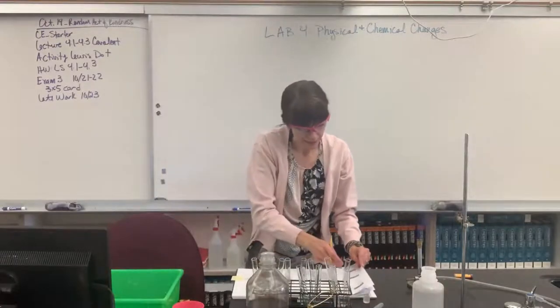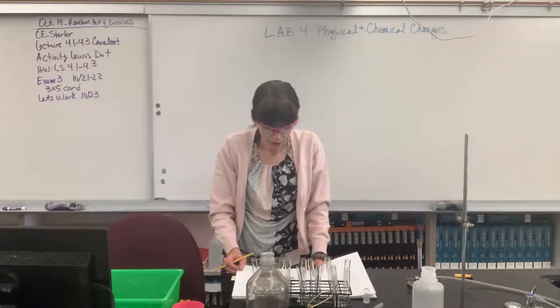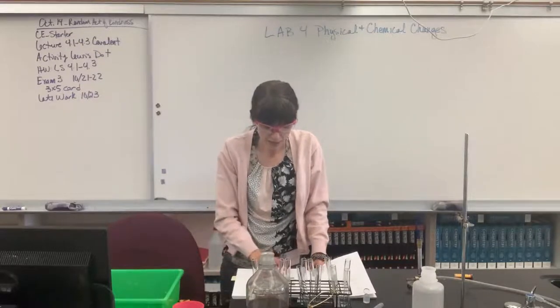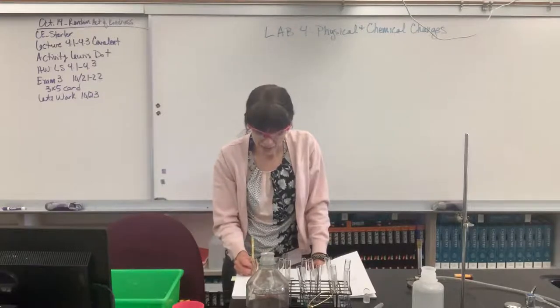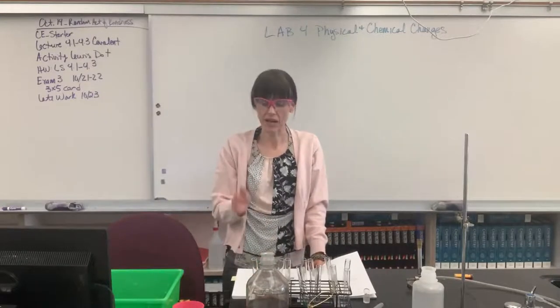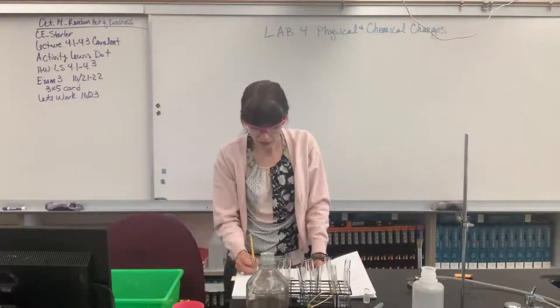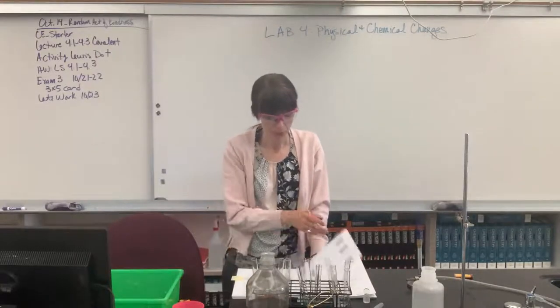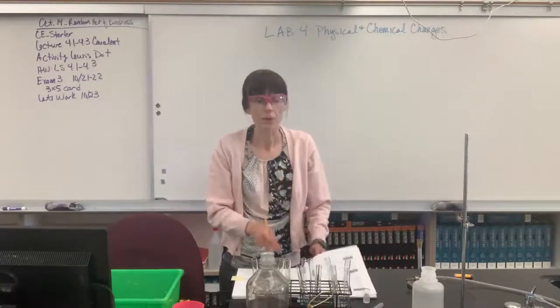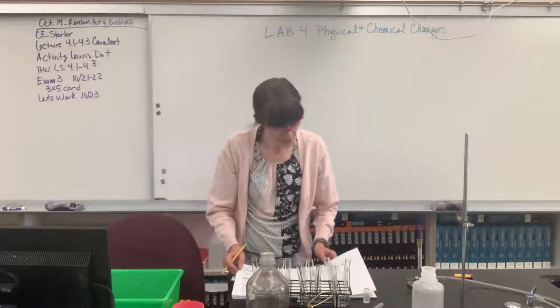So come back to B, that was on page 53. So the heated sample color was black. When we cooked it, it was black. But then when we added the HCl to what had been heated, it went back to green. Super interesting, kind of cool. Now let's finish part C. So the directions on part C.